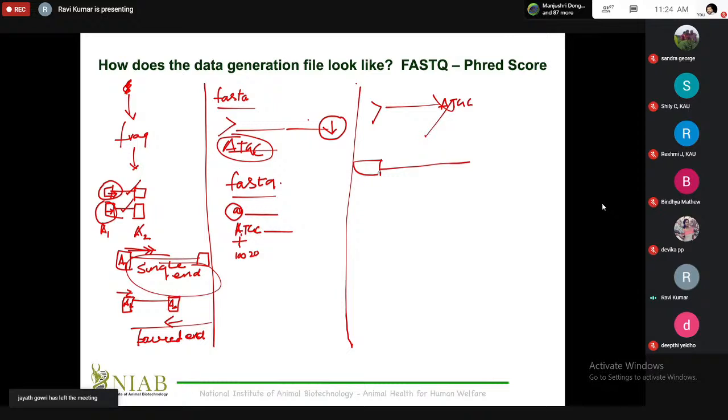Is that okay? So it means you are telling the vendor, once you start sequencing, you have to sequence to that particular length which you desire. This can be 25, 100 base pairs, or 300 base pairs. Now, what I mean by a read is, this FASTQ file that is generated will have an identity of this particular sequence, this particular fragment. So this particular ATGC, whatever you have given, will go to a length of either 75 base pairs or whatever is your desired length which you have asked the vendor to sequence.